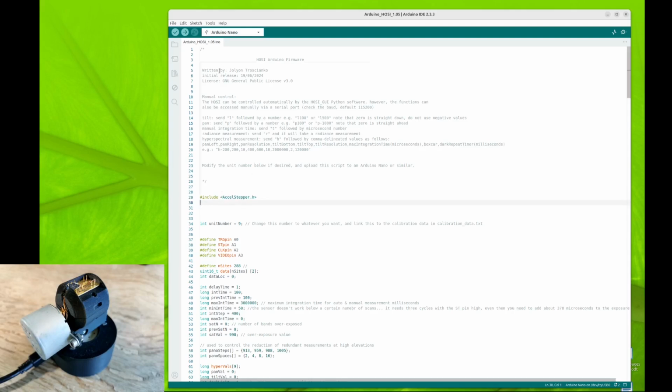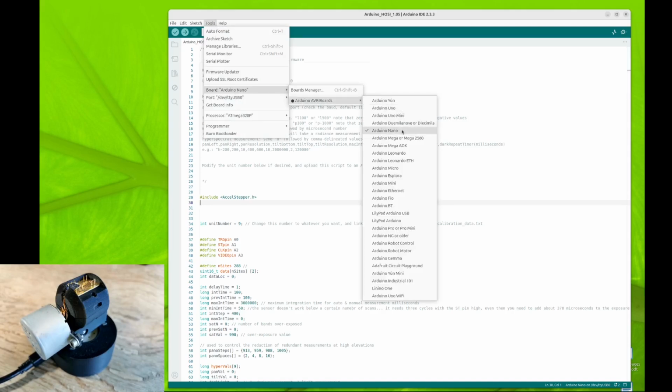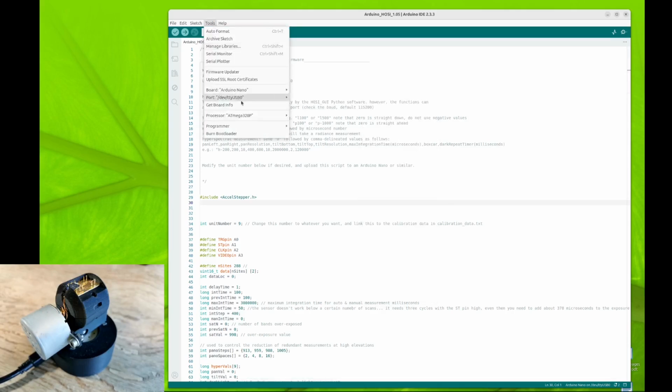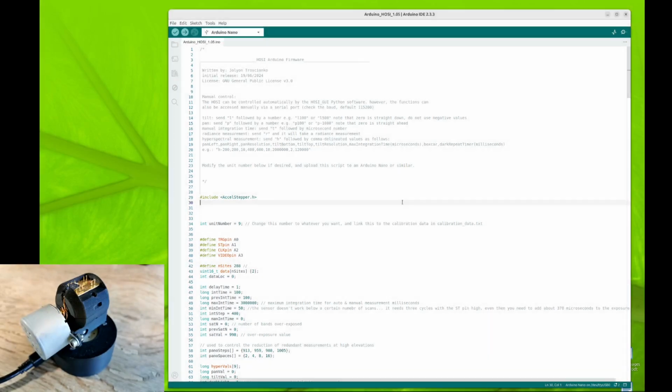Next, you need to make sure the board is attached. So here I have plugged in the USB cable to my Arduino and plugged it into the computer. And then you need to select your board. So this is an Arduino Nano. And select the port. So on my computer it's reading it at this port. And you can just check that there's a board attached there. It tells you the ID of the board and so on. Check it's communicating with your system correctly.